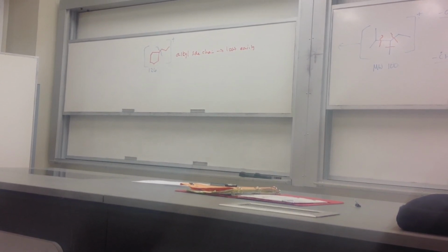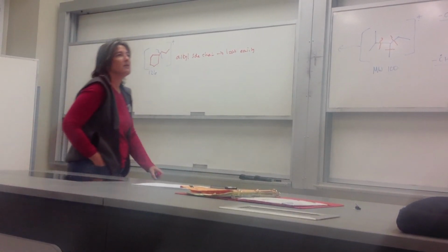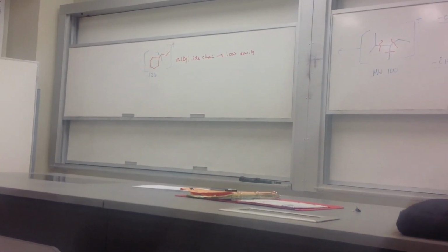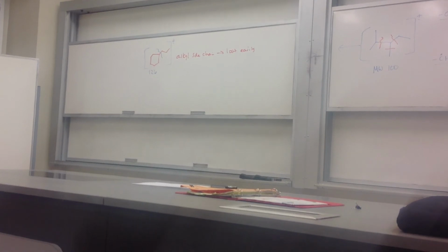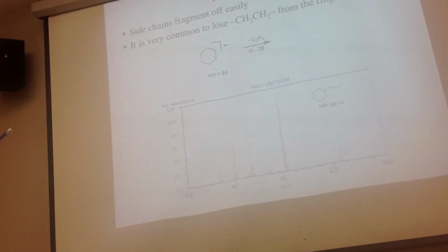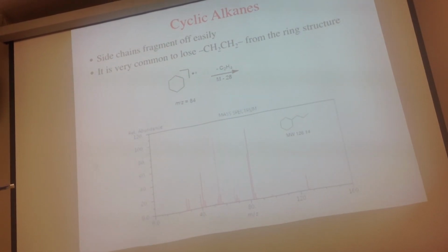For the equation, this shows 2 carbons, but the molecule actually has 3 carbons in the chain. Oh, yeah. On this one, I suspect that's probably an ethyl. It's there, C2H4. And our example we're gonna do is the 3. Okay.